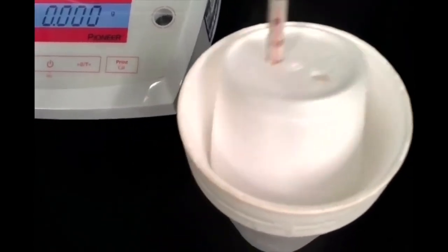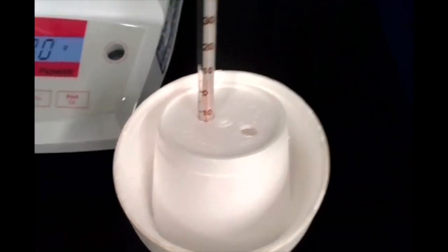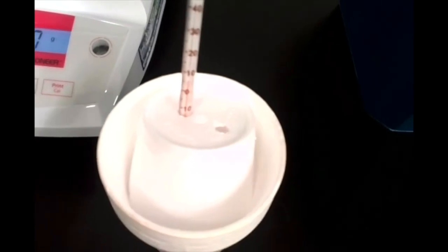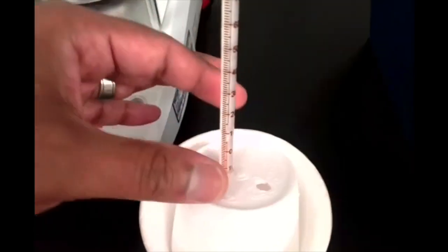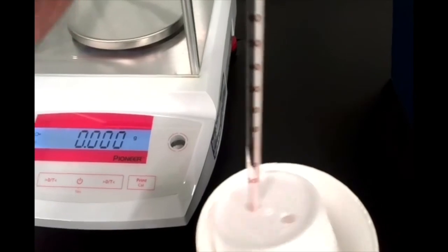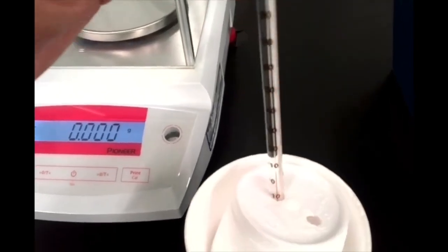Hoping that by stirring this, I'm getting the warmer water and the cooler ice to mix a little bit better. You want to be careful not to stir too vigorously because you don't want to generate any friction. That also is a source of heat and that can mess with your results a little bit. Again, you're stirring gently enough that I think it should be okay. Let's see if our ice cube's melted. Nope, I think I still see it in there.